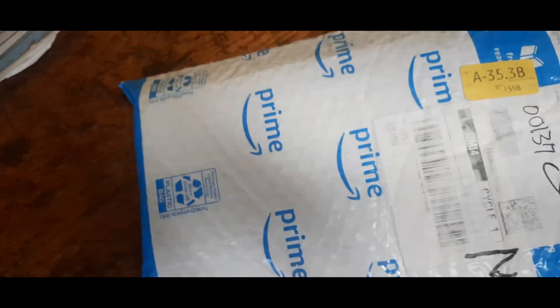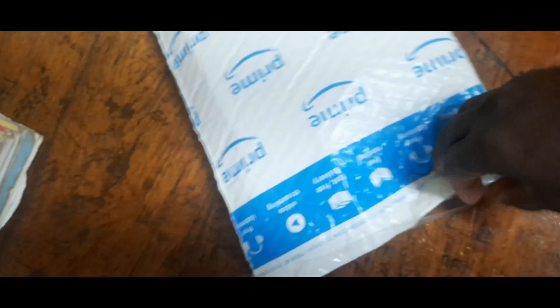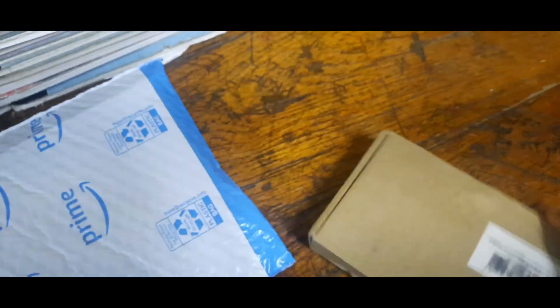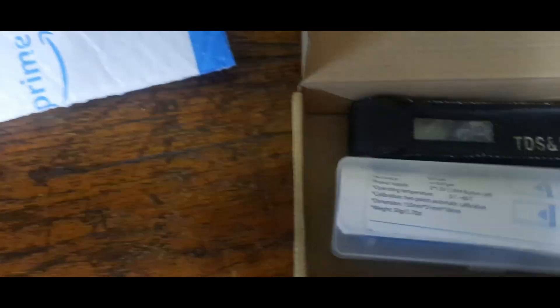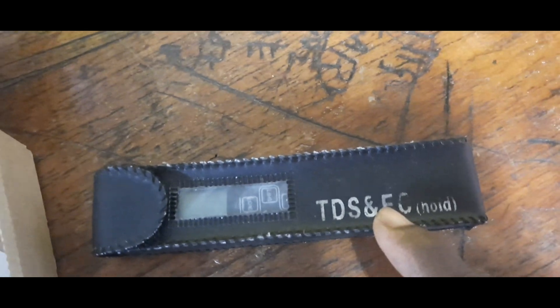Let us open the package now. The courier had done some initial opening, so I just need to do the final part. Wow, there's a nice box inside — let me get it out. It was easy to open. There are my little tools inside!